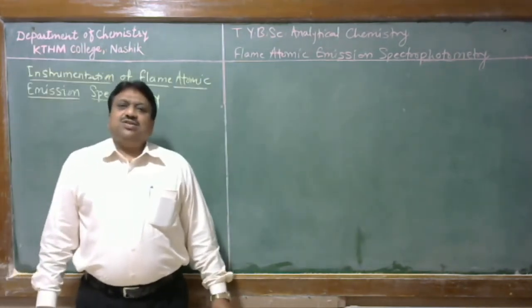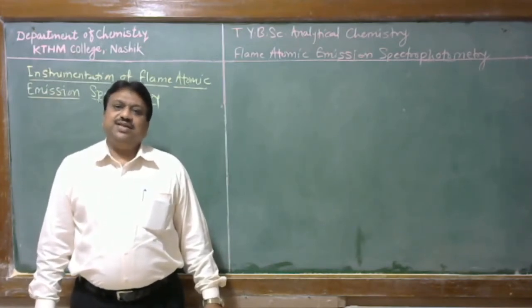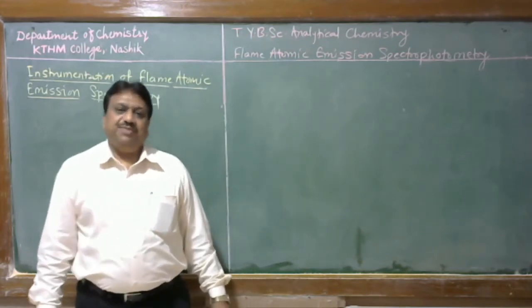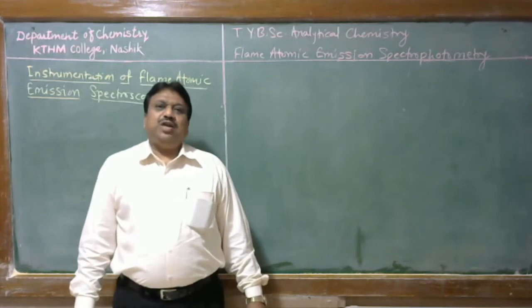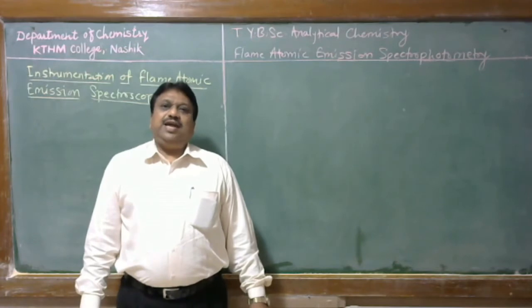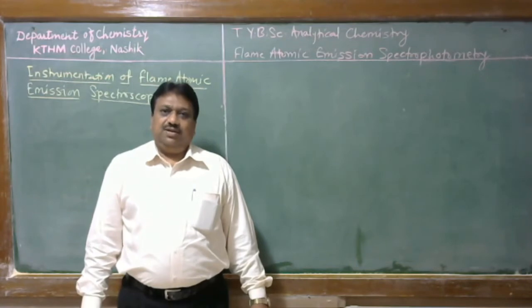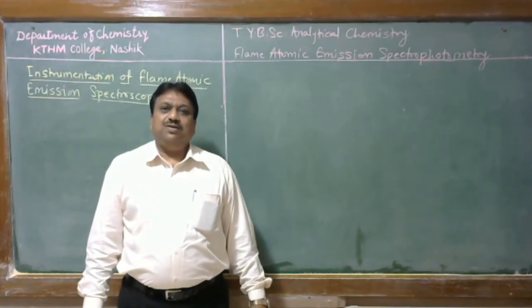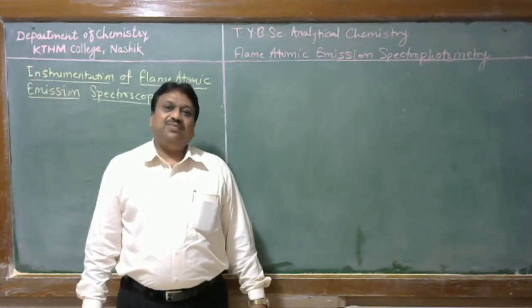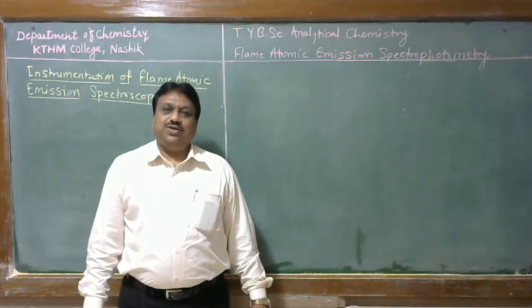Student, after discussion about the factors affecting the intensity of the emission line, now we discuss the instrumentation of flame atomic emission spectroscopy. Flame atomic emission spectroscopy is a branch of atomic spectroscopy. In atomic spectroscopy, the sample should be in the form of atoms. All atomic spectroscopic methods are performed on a sample of gaseous state atoms. Therefore, the first requirement for an atomic spectroscopic method is to convert the sample solution into gaseous atoms.